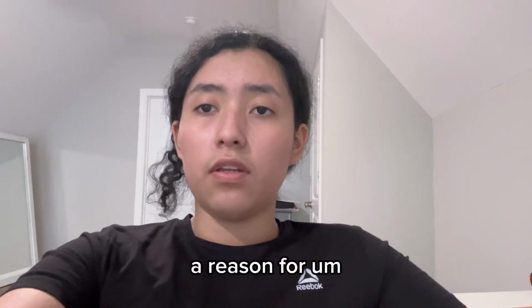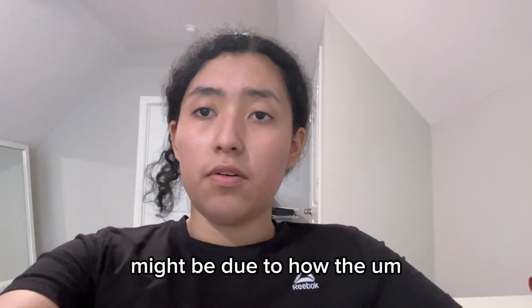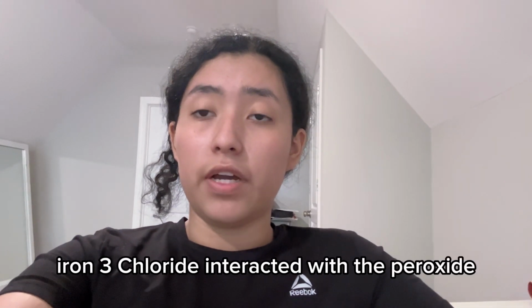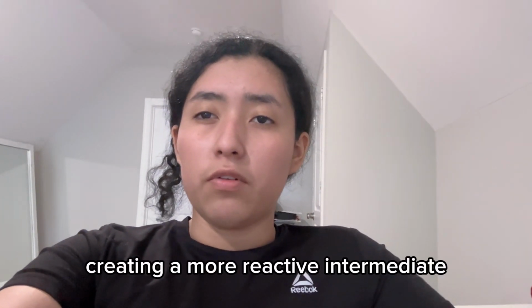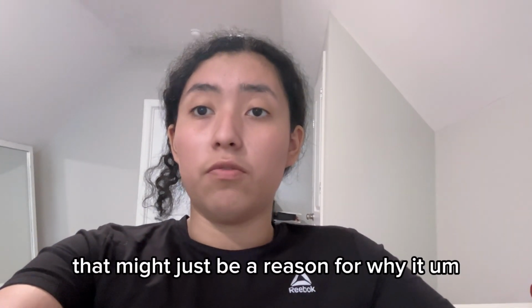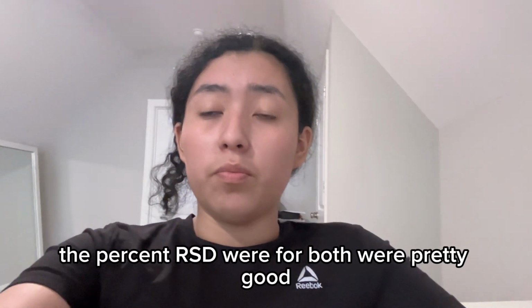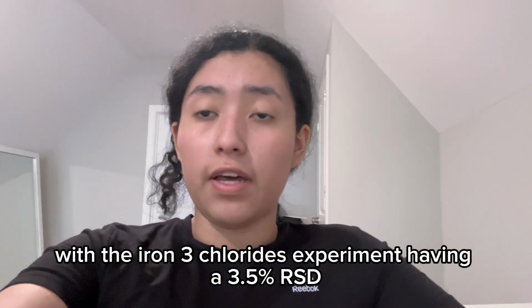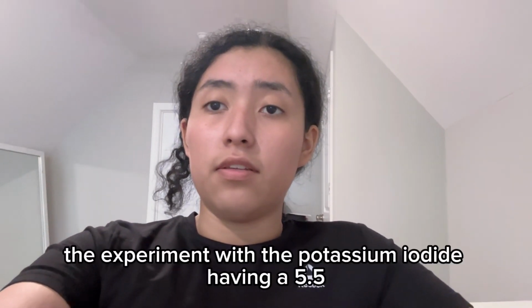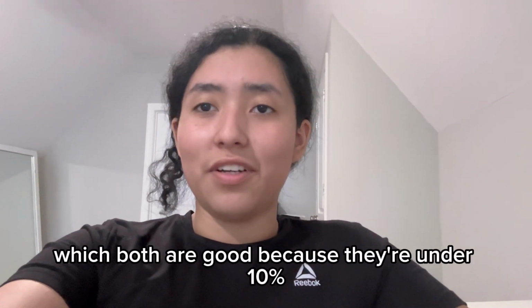A reason for the better results for the iron 3 chloride might be due to how the iron 3 chloride interacted with the peroxide, creating a more reactive intermediate. That might just be a reason for why it helped decompose the hydrogen peroxide better. The percent RSD were pretty good, with the iron 3 chloride experiment having a 3.5% RSD and the experiment with the potassium iodide having a 5.5, which both are good because they're under 10%.